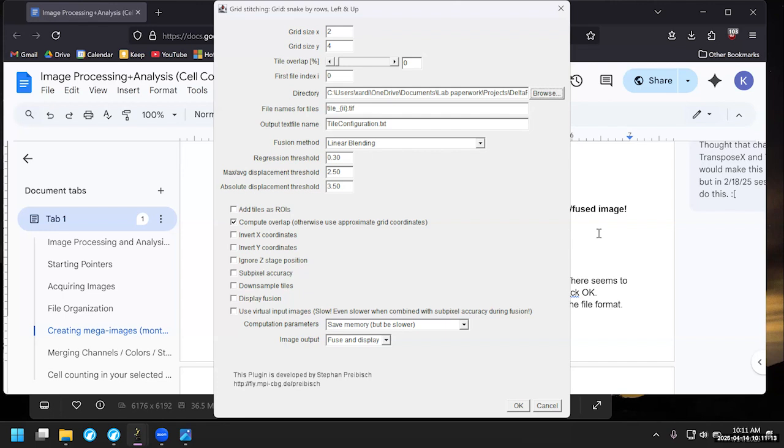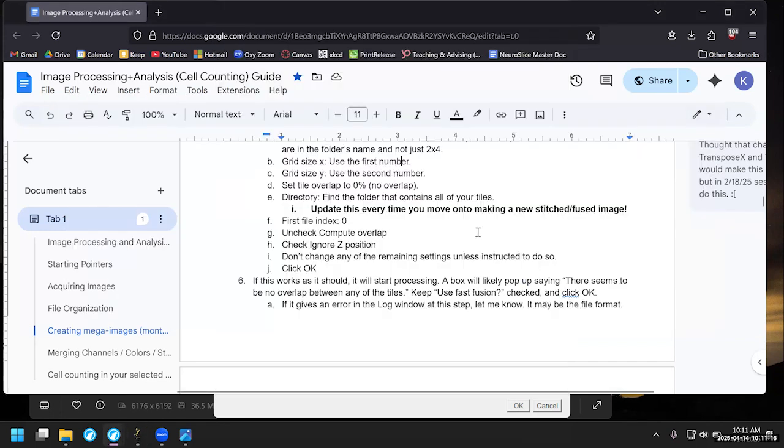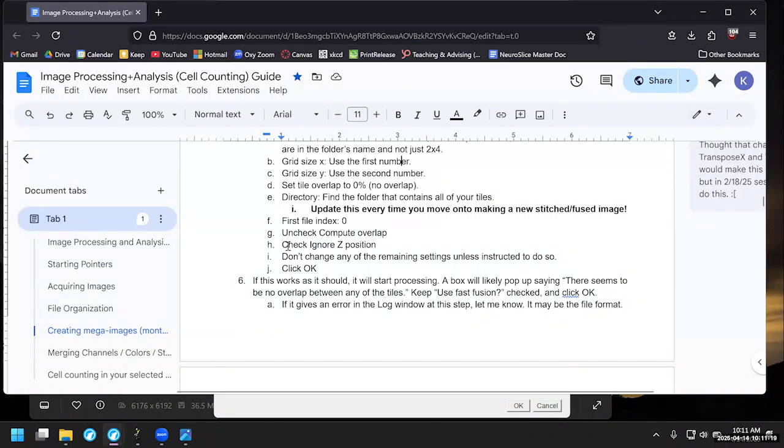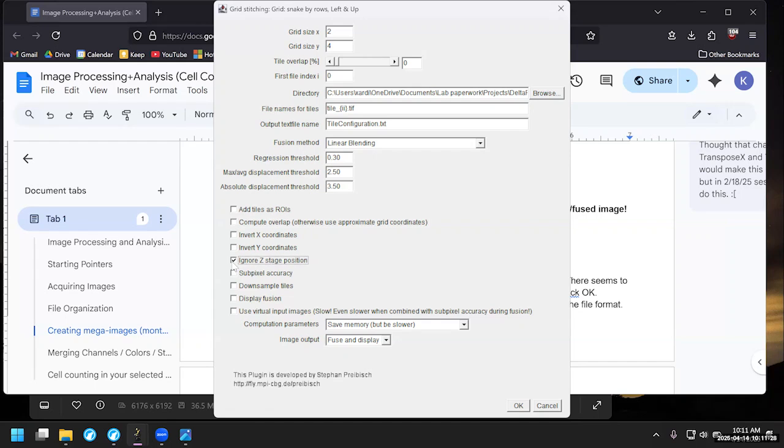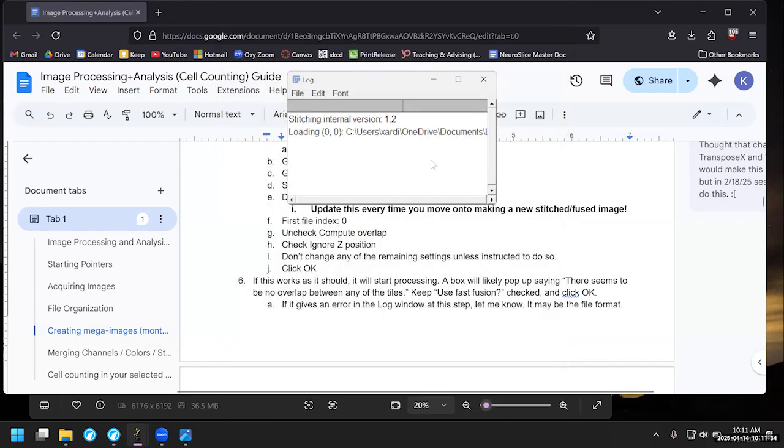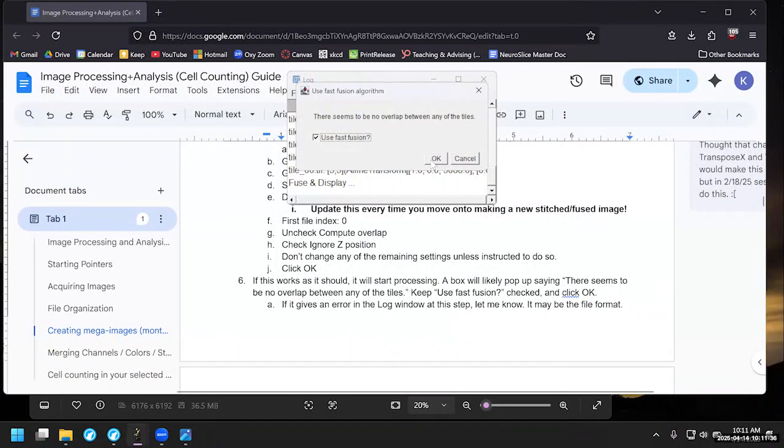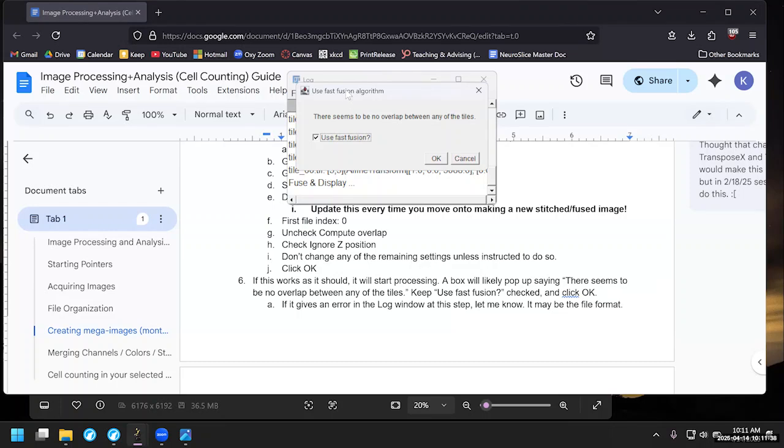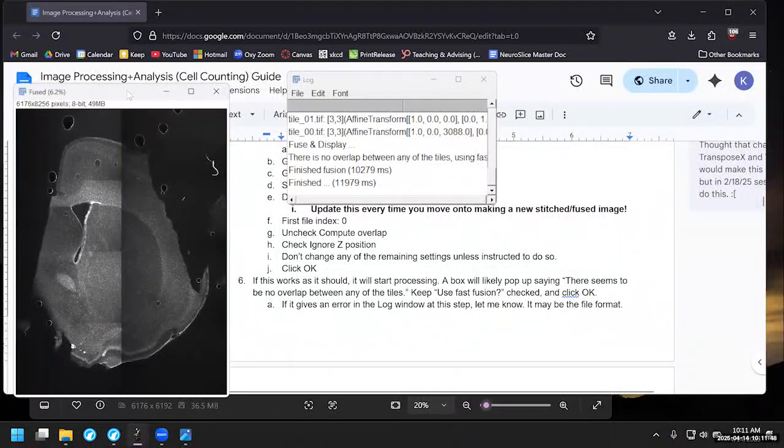We're not going to bother with the linear blending because there's no actual blending that's going to take place since they don't overlap. We do need to check off a few things. So uncheck compute overlap. Check ignore z position. Do not change any of the other settings. So uncheck, check. Leave this all as is. We will hit okay. And as long as everything goes all right, you should get to fast fusion. There seems to be no overlap between any of the tiles because we set it to zero percent. Use fast fusion. Certainly. Yes. And then we get the final result.